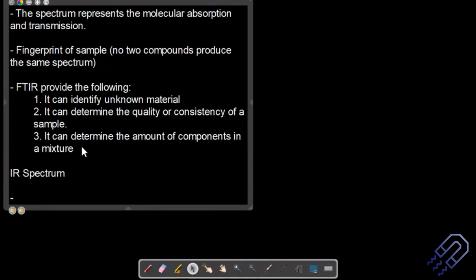But what I'm saying is FTIR, Fourier transform infrared spectroscopy. How is it different? How does an infrared spectrum take up so many frequencies together and put them together in a graph? That is more important to understand. For that, we won't go to FTIR first. We will first go to the IR spectrum. The IR spectrum is basically an old technology. Nowadays, it's mostly FTIR.